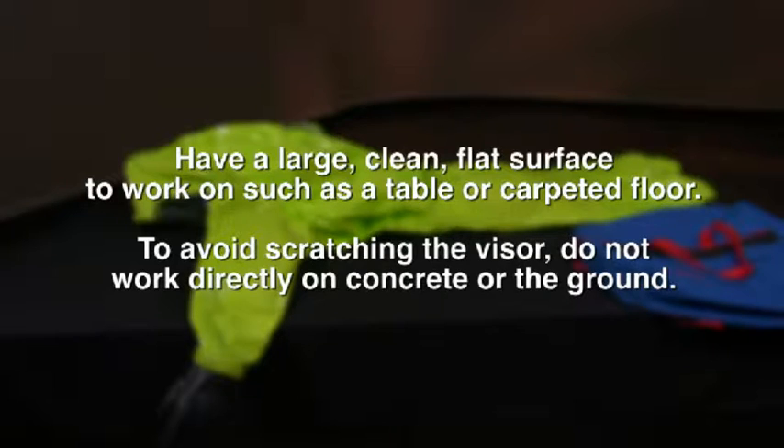An encapsulated chemical suit should be folded properly to ensure an easy fit into its storage bag and to minimize the potential for handling damage to the suit. It is best to have a large, clean, flat surface to work on, such as a table or carpeted floor.